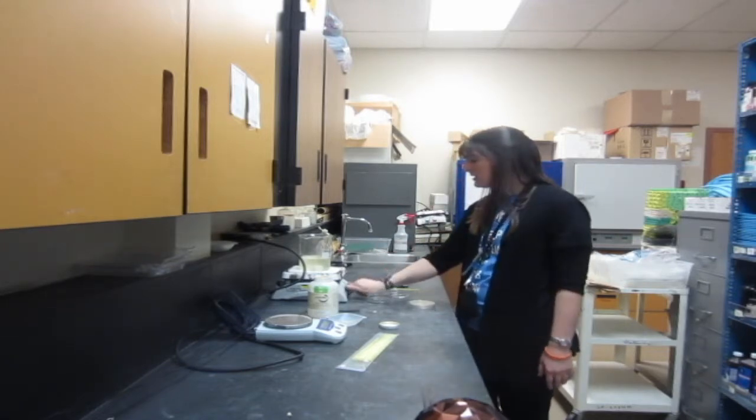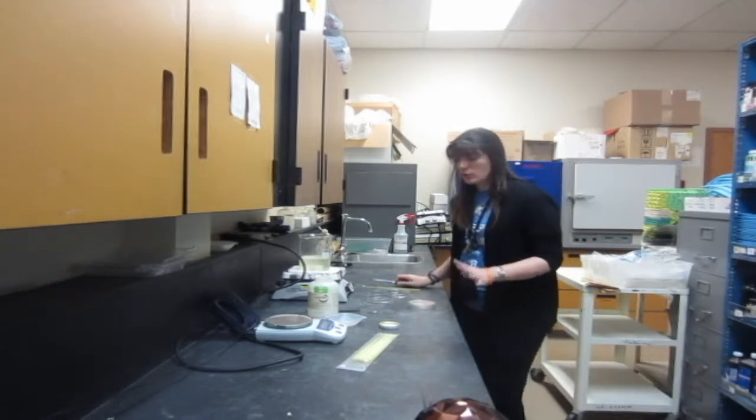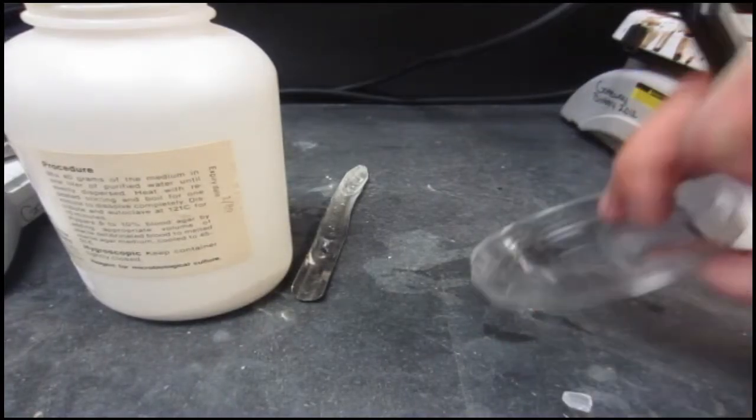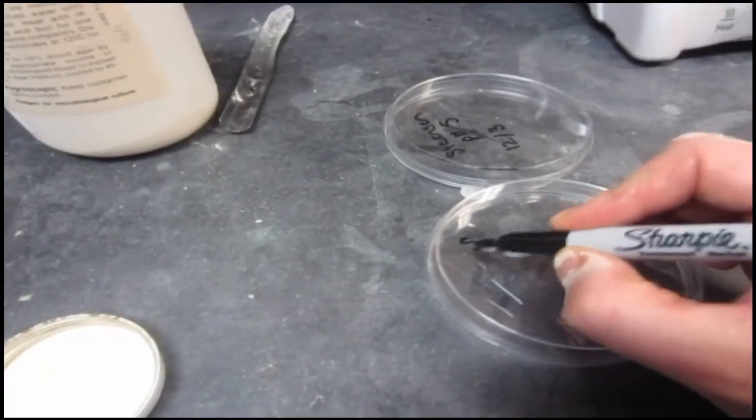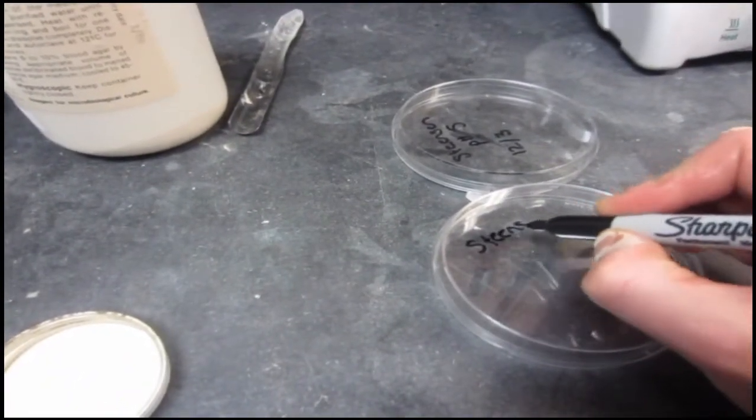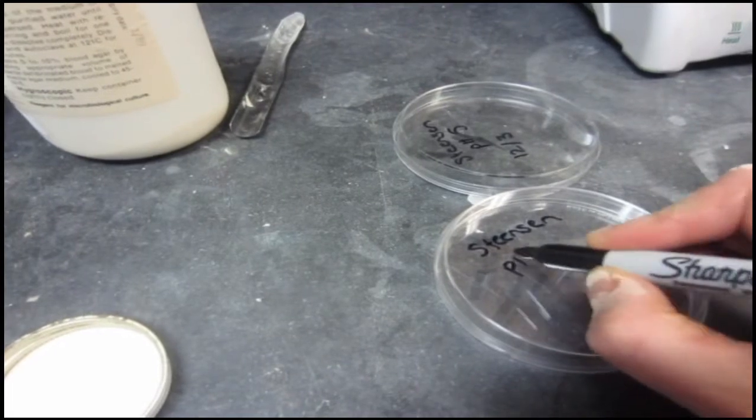Once you have your agar all ready, then you are going to be ready to create your petri dishes. The first thing you want to do before anything else is you want to label these things. Always label the bottom, not the lid. It's just good practice to make sure that you don't lose any of these parts.